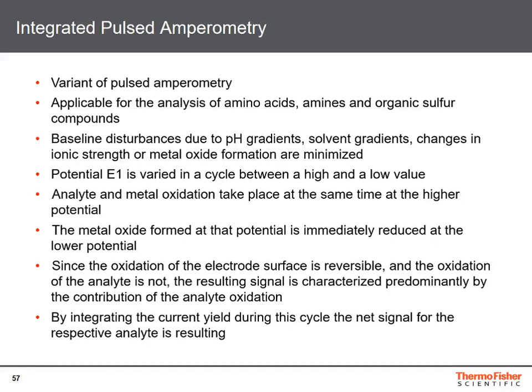Professor Lacourse, working at the University of Baltimore in Maryland in the United States, discovered this effect at the end of the 1990s. Analyte and metal oxidation take place at the same time at the higher potential. However, the metal oxide formed at that potential is immediately reduced at the lower potential.